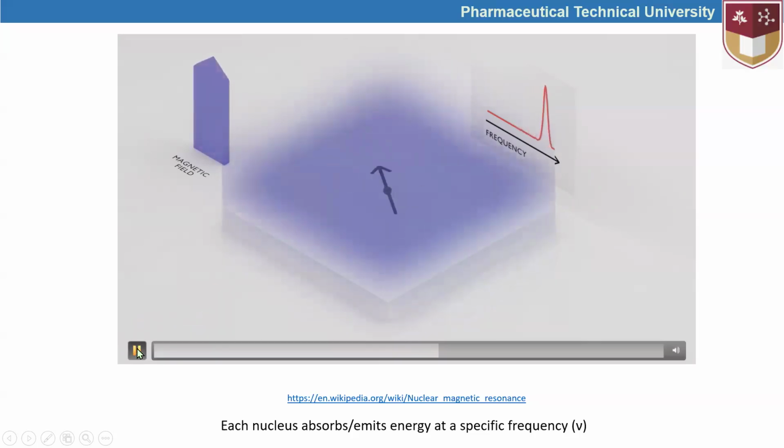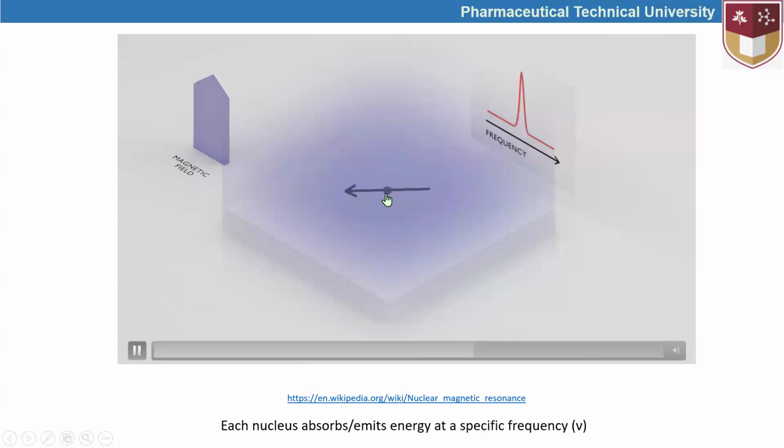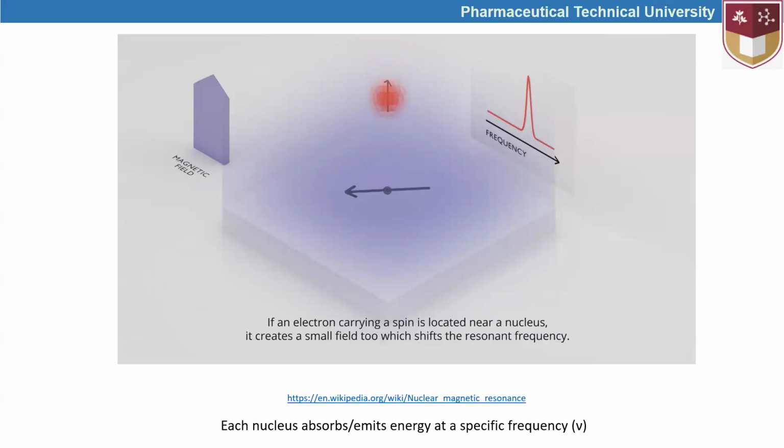And another point that we have to understand here is that this kind of changes also result from the shielding or deshielding effect of the electrons. If the electrons are closer or farther from the nucleus, that might be observed in different functional groups like CH2 in alkanes or OH in water.